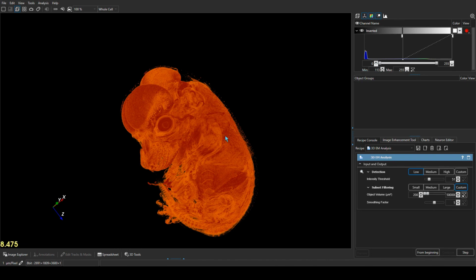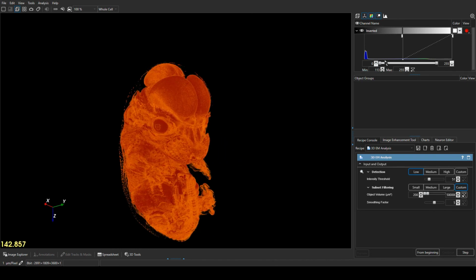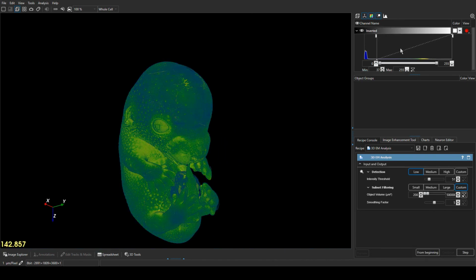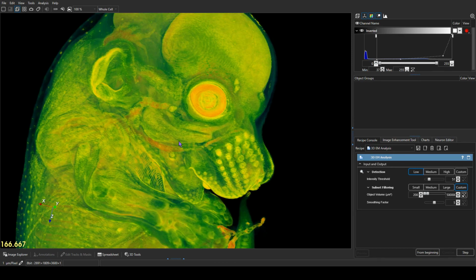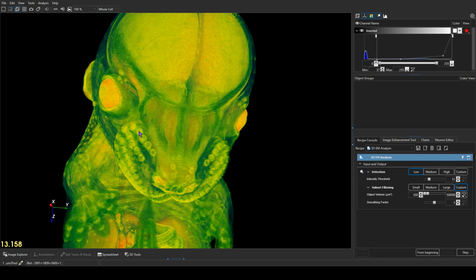Can render the inside if you prefer. I don't think I've ever shown that the lookup table can be optimized, can be adjusted. So I'll take the opportunity to show it now. It doesn't have to be a linear progression here on this line, which gives us the possibility to make some of the channels semi-transparent.